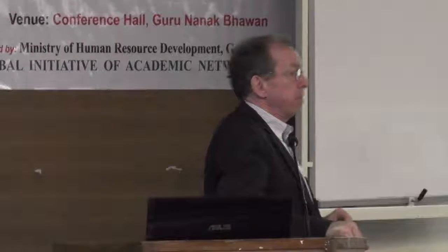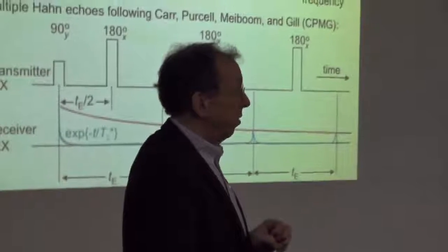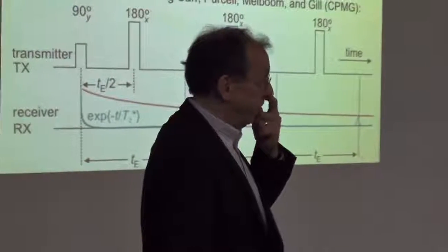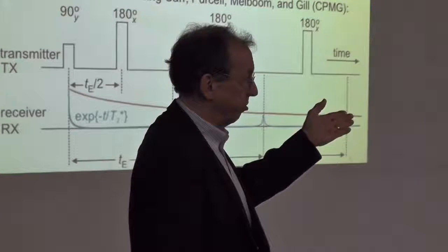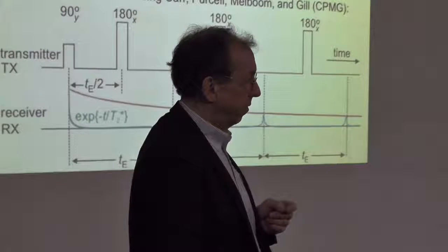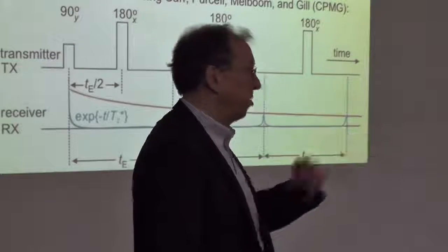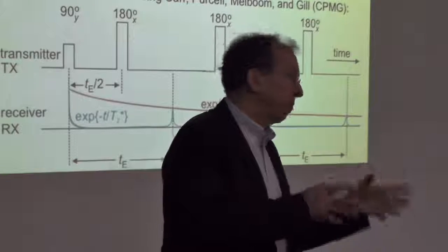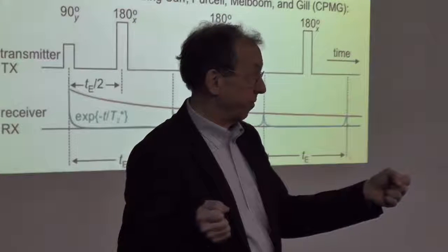Can it be more reliable to have T2 star? Pardon? T2 star, it is taking into consideration the inhomogeneity. Yes, it consists of the true T2 and the field inhomogeneity contribution. So that means T2 star is actually the true value instead of T2 only. No, you want to measure T2, or let's say most people want to measure T2, because that only depends on molecular mobility and motion.